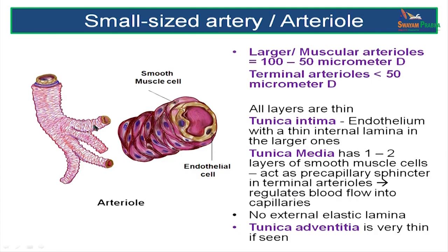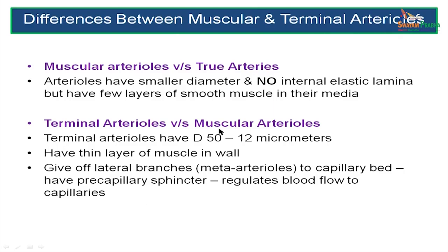Here you can see an arteriole with smooth muscle cells in its wall, one endothelial cell and another endothelial cell forming the lumen of the arteriole. Arterioles have a smaller diameter and no internal elastic lamina, but they have one to two layers of smooth muscle in their media. Terminal arterioles are smaller, have a thinner layer of smooth muscle, and give off branches called meta-arterioles which enter the capillary bed. They have pre-capillary sphincters which regulate blood flow into the capillary plexus.